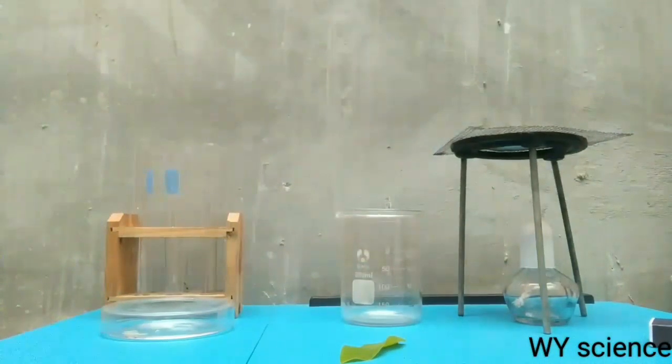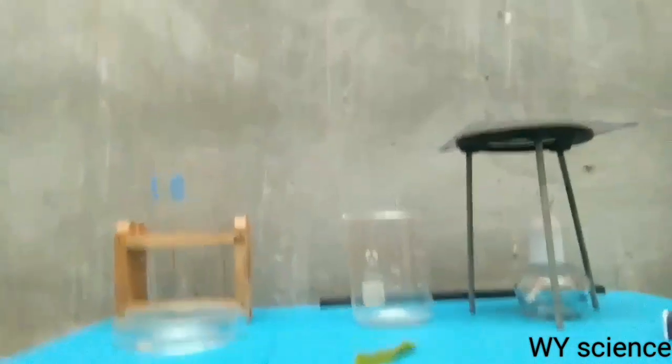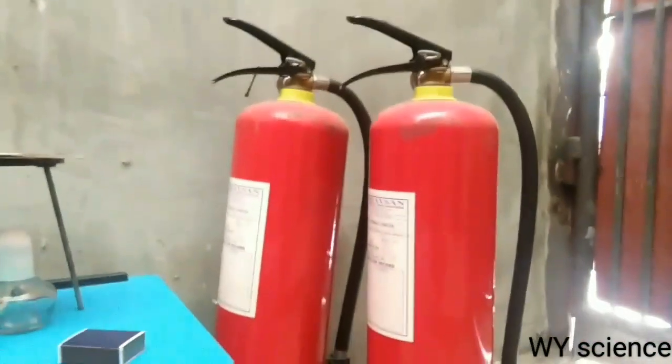We are now ready to proceed with our experiment, but before proceeding, make sure to wear safety gear and have fire extinguishers by your side.